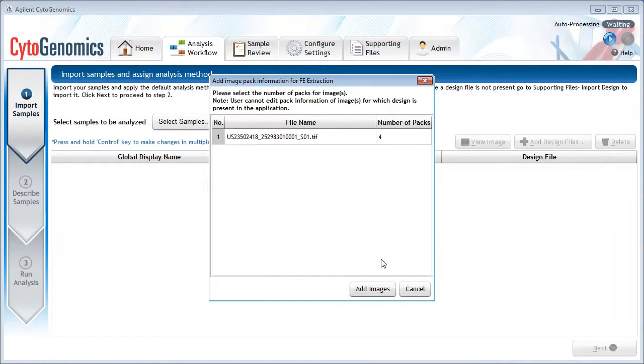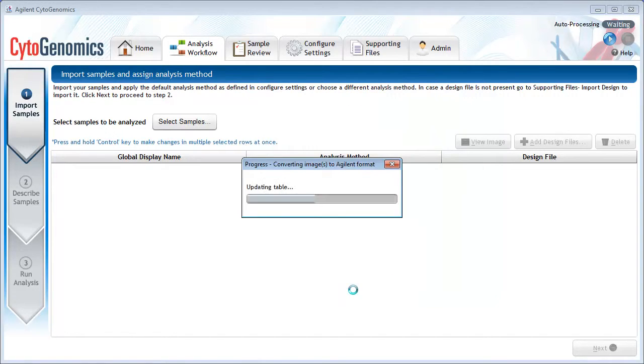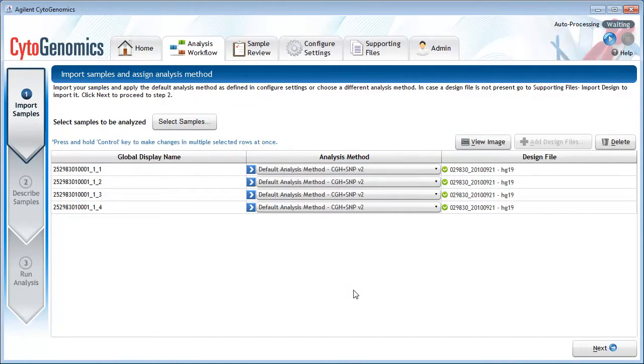This dialog box is confirming that the image I am importing contains four arrays on a single slide. Click Add Images to import all four arrays. And now the samples appear in the table.